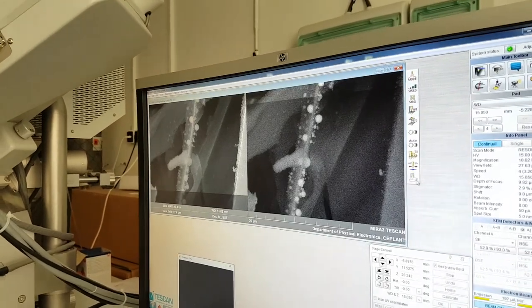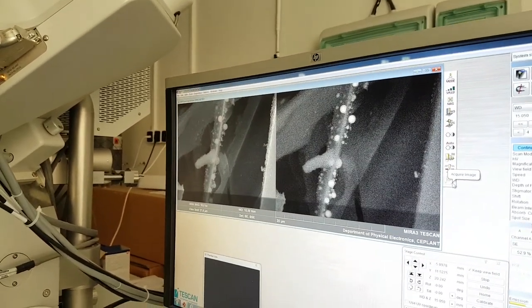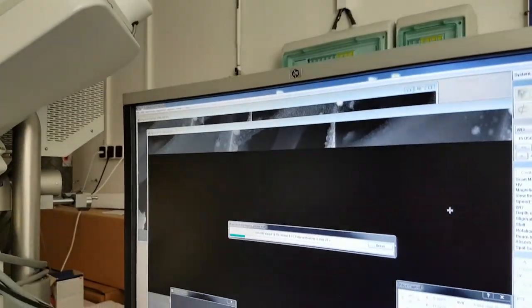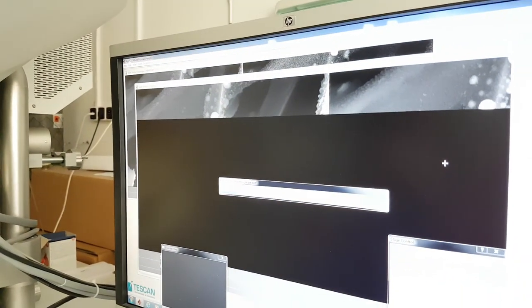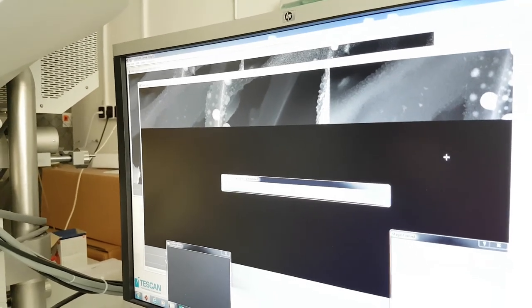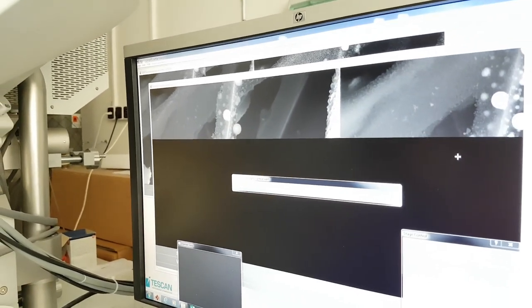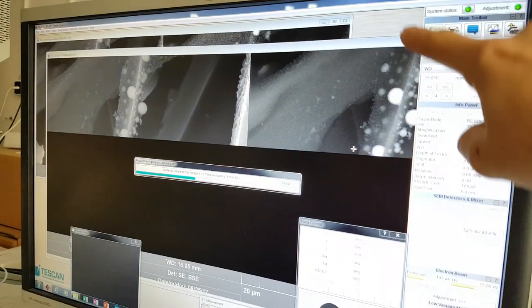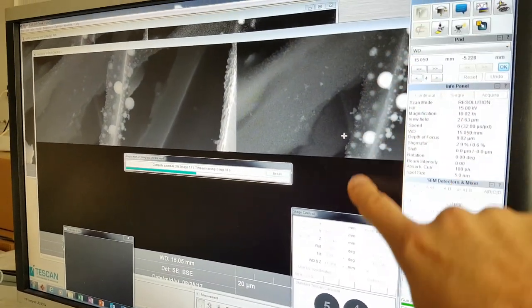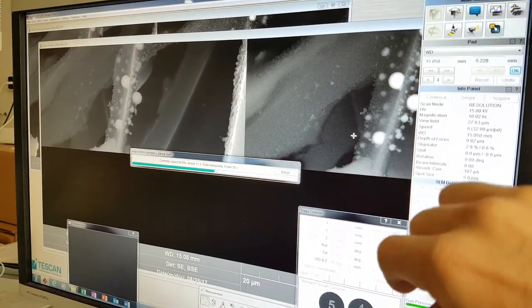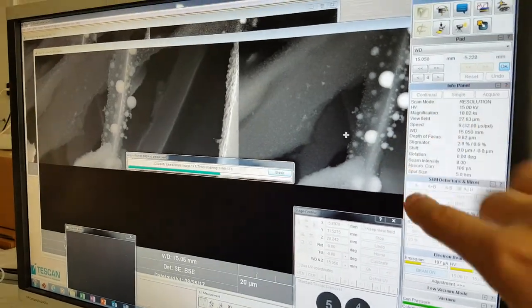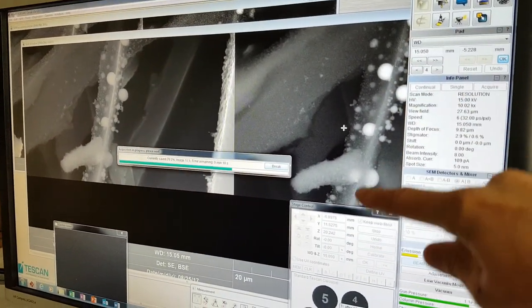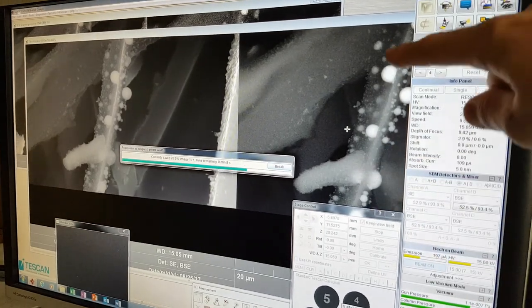So, maybe the carbon of that piece of wood got lofted up into the plasma and because it doesn't melt, because carbon's got such a high melting point, you had condensation of the metals that were at least in the plasma. Of course, you know, we need to do a lot more tests before we're absolutely certain they're being formed in the plasma but there's definitely some spheres here.